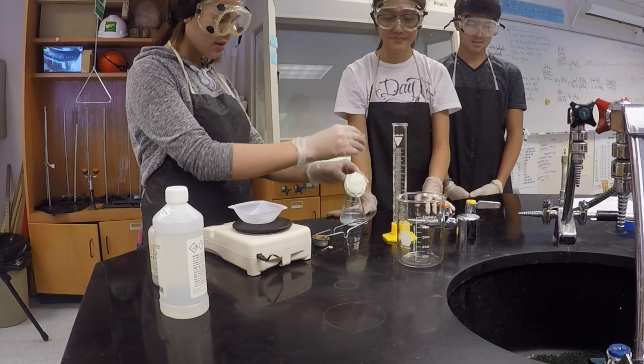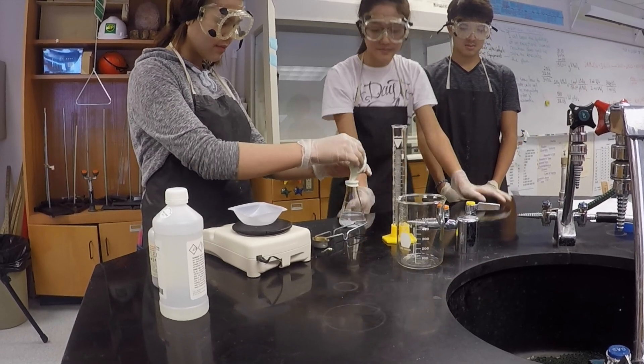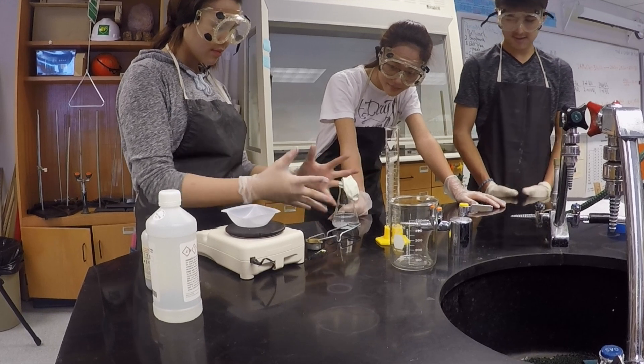First, you need to put zinc metal into the balloon. Then, measure 70 milliliters of hydrochloric acid and pour it into the Erlenmeyer flask.